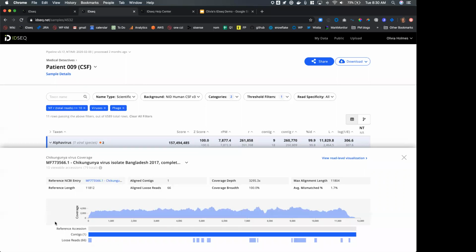metrics. And then the second part of that question, does the pipeline do any de novo assembly of metagenomes before sequence ID? So we actually do de novo assembly using SPAdes, and we output the resulting contigs in our report page. It's also possible to download all the reads associated with a particular taxon and reassemble them using offline pipelines specifically tailored to that pathogen, if that's something that you're interested in.